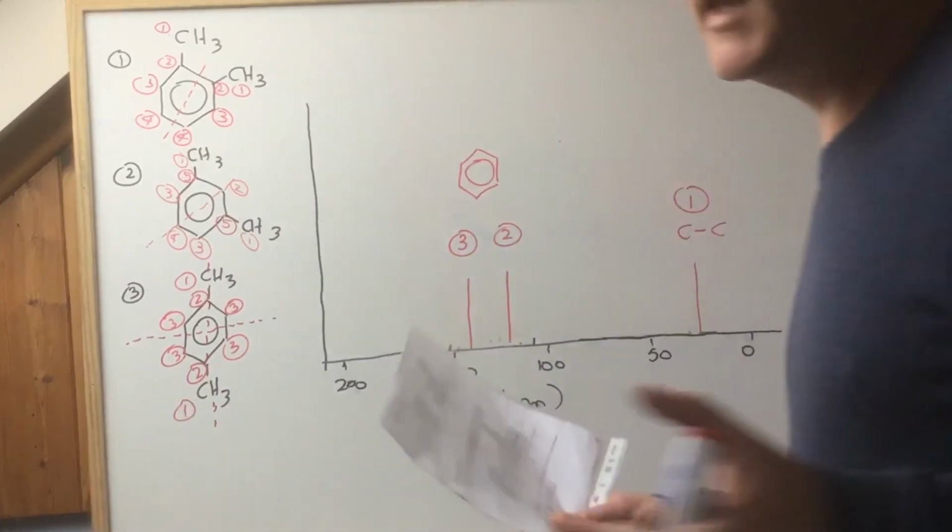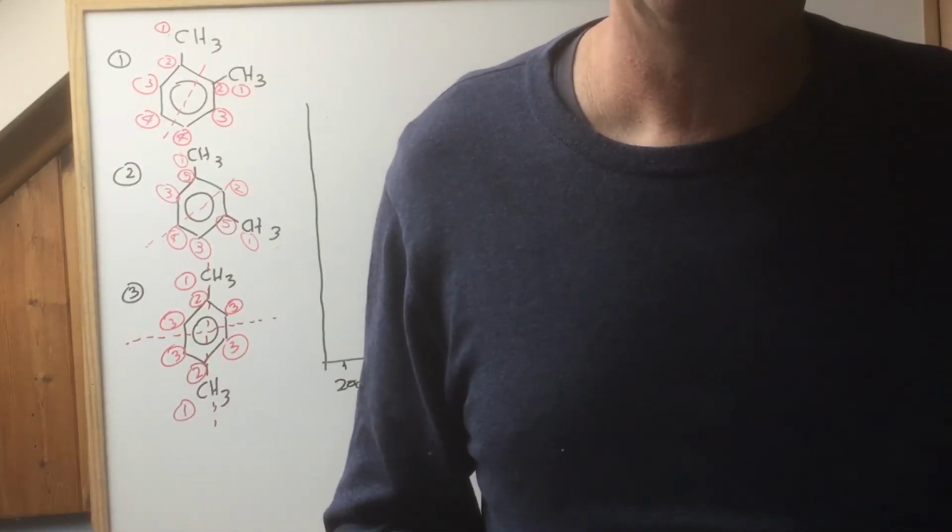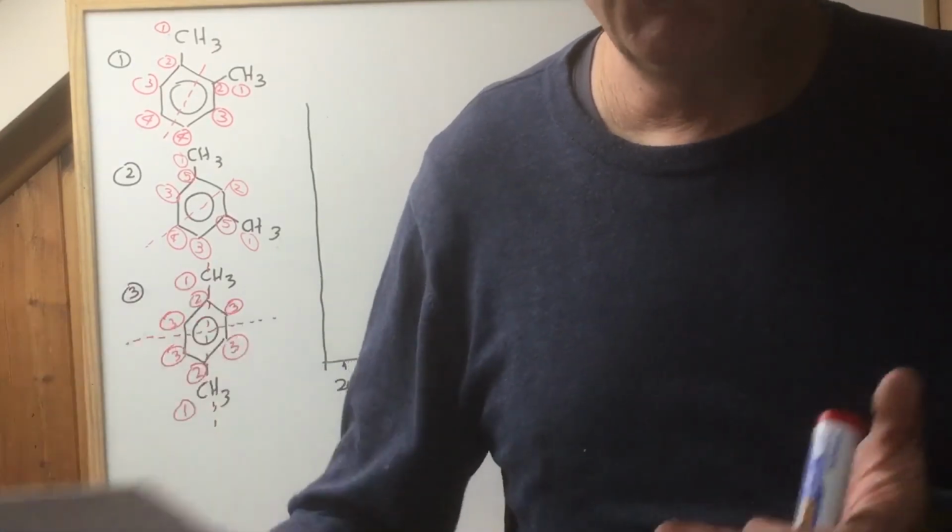So it's all about the chemical shift and the environments being similar or the same. Okay, that's carbon-13. Look at some questions.